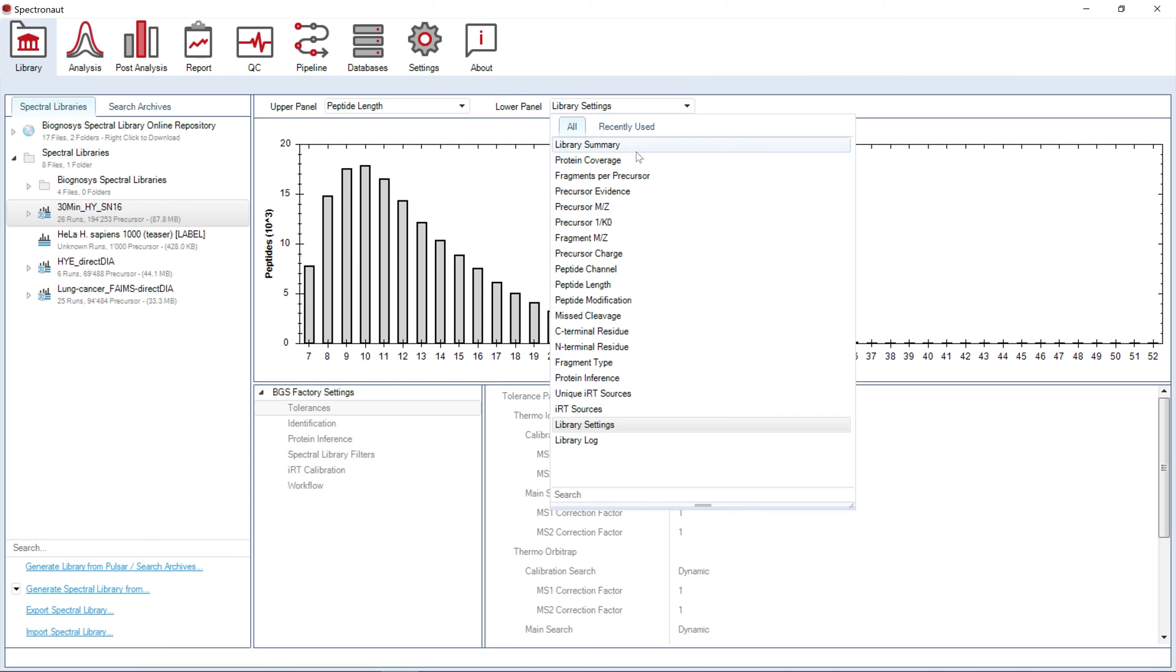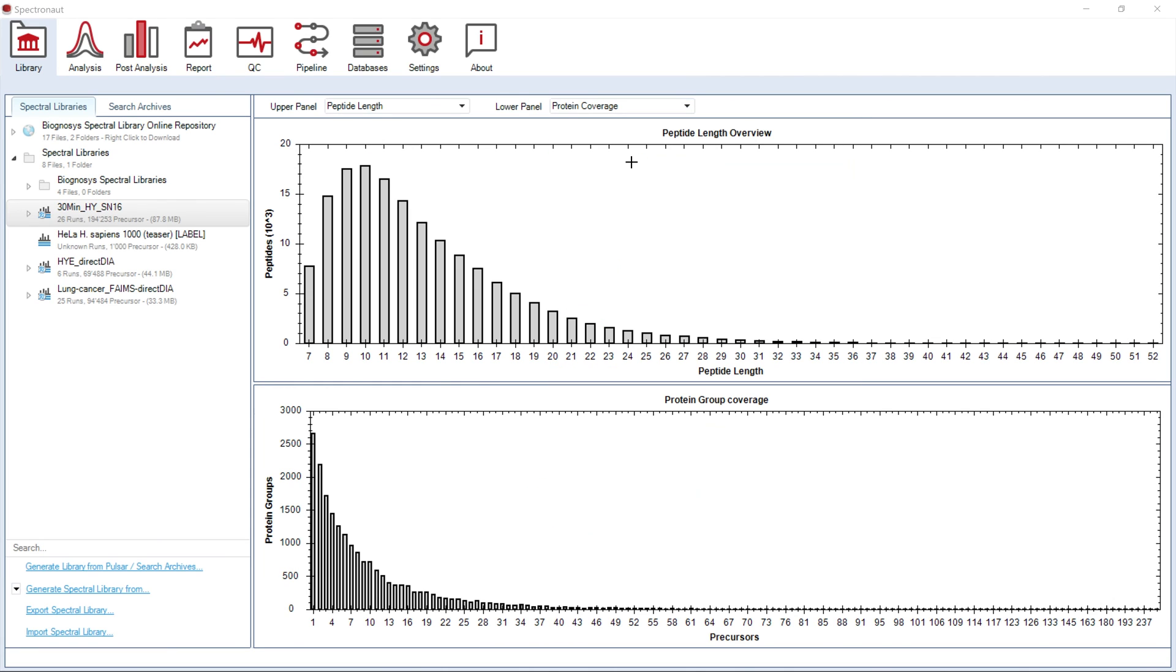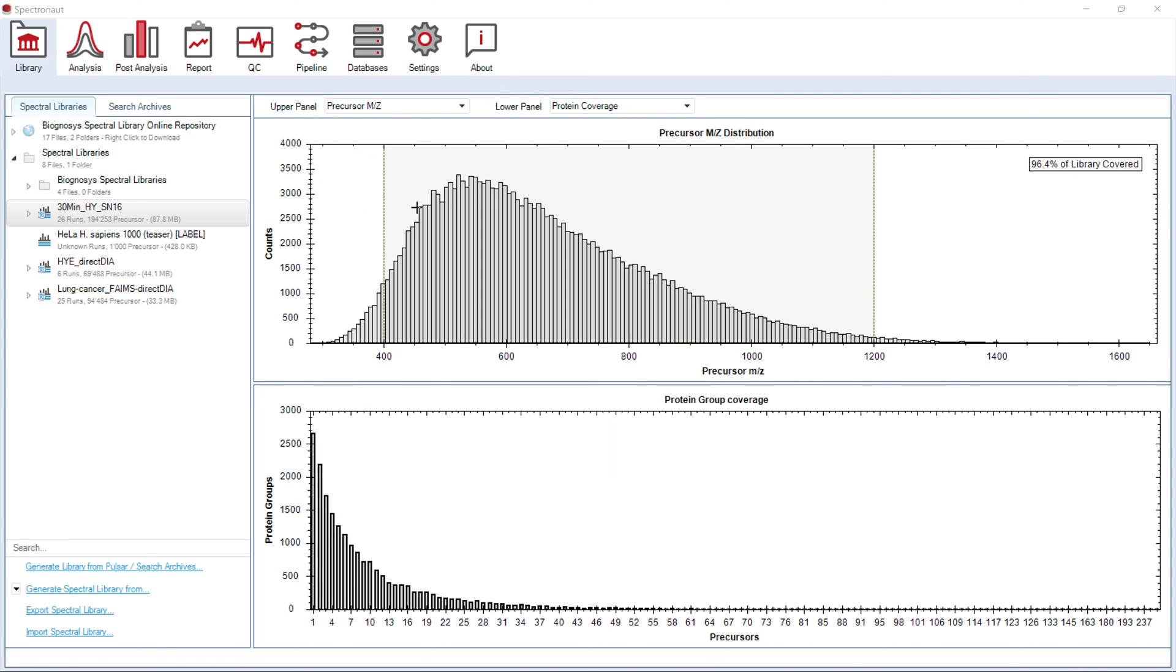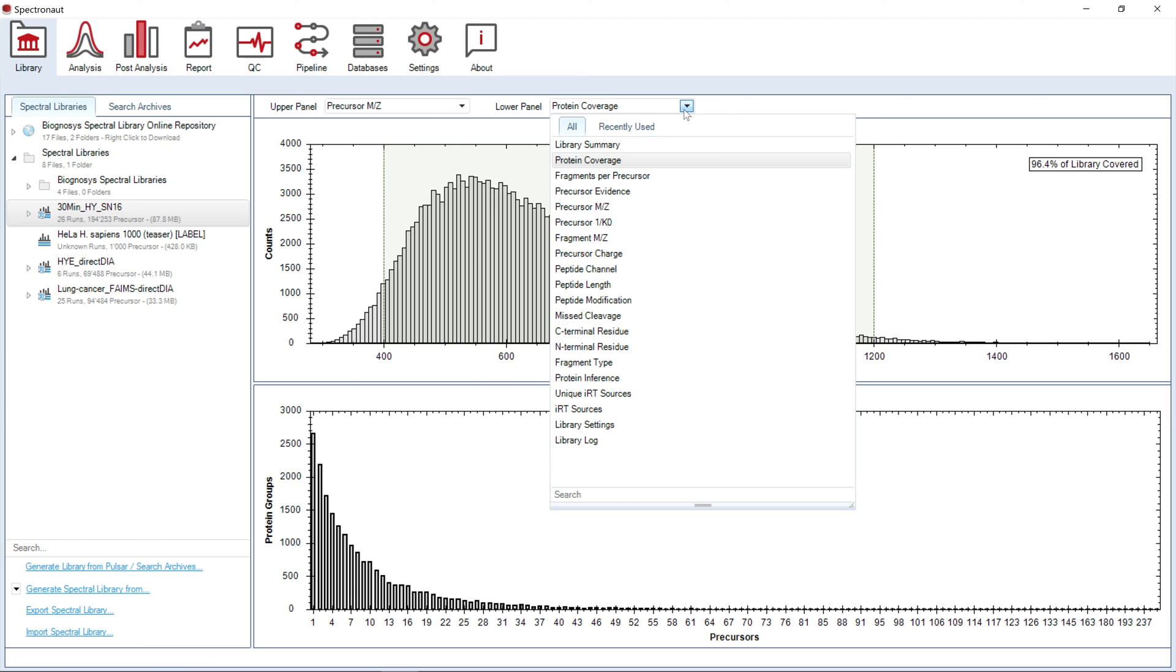Finally, you can select multiple visualizations to see the coverage of proteome achieved in your library. Among others, you can select here, for example, peptide length plot or protein coverage. You can also use readouts from the plots to further optimize your acquisition methods.